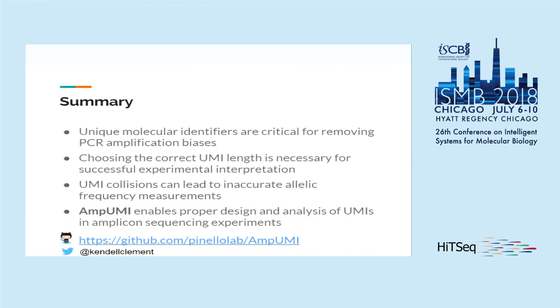Hi, thank you very much for your presentation. I'm from Thermo Fisher Scientific, and we just launched a recent product with UMIs to do liquid biopsies. When we do the design, we struggle with the UMI lengths. So my question is, when you consider the UMI lengths, have you considered UMI collisions affected by the sequencing errors?